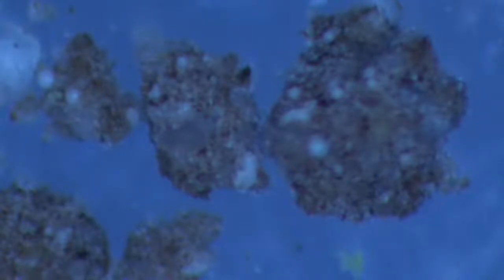Could I look at here? I've got tons of random stuff. I am definitely going to grow some bacterial plates from different drum machines and keyboards just to see what's on what. I'm probably going to take some samples from the music store too, just for kicks, to see what the public is bringing into the music store.